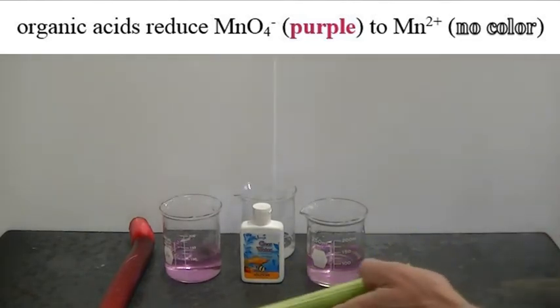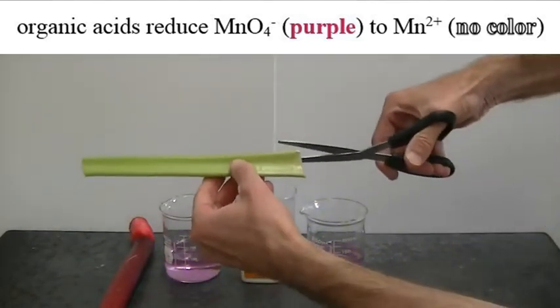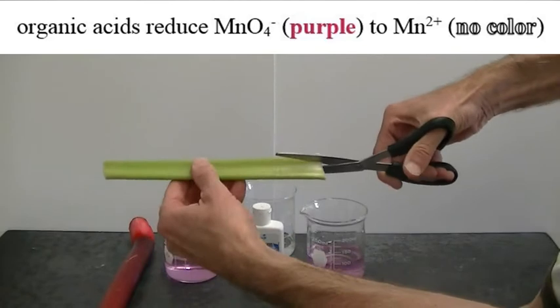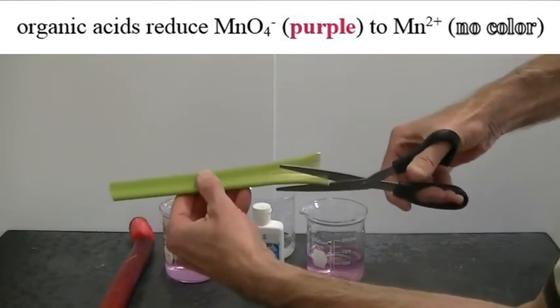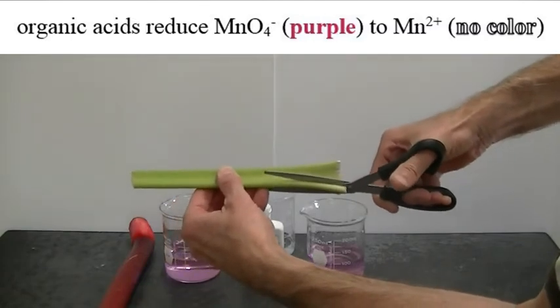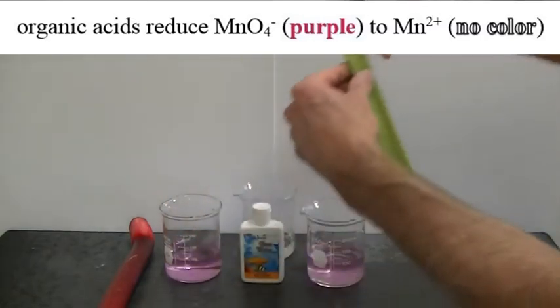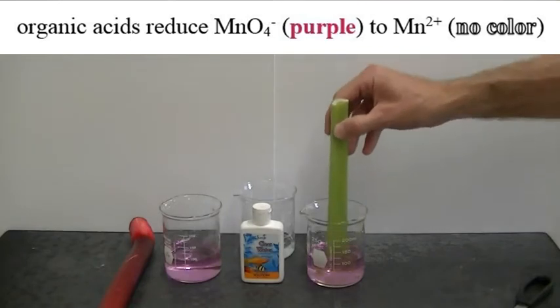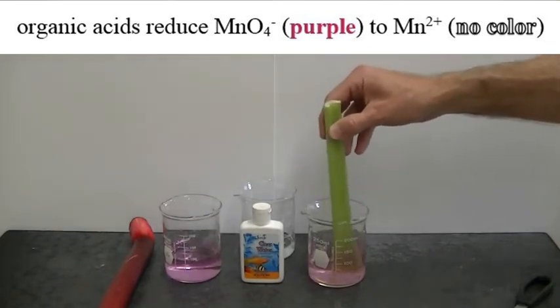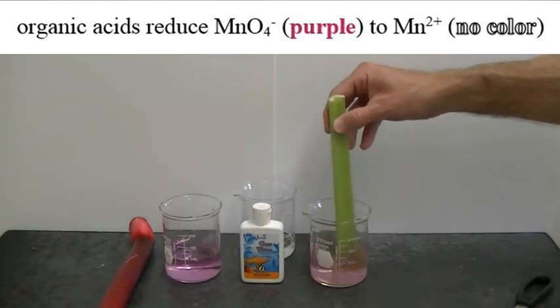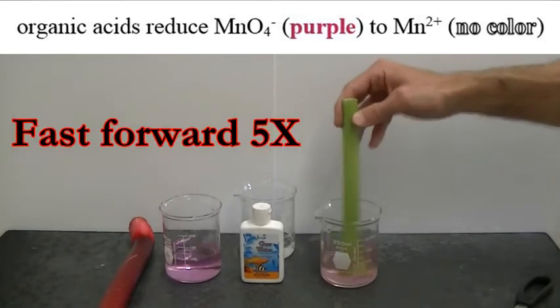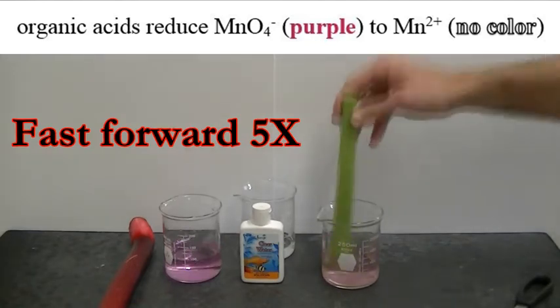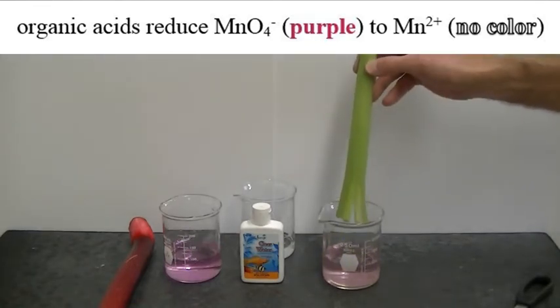Now first, I'll take this stalk of celery and I'm going to cut it three times lengthwise. And the reason why I'm doing that is because I want the contents of the celery stalk to be able to mix very well with the potassium permanganate solution. And I'll just stir the celery stalk into the solution of potassium permanganate. I see a slight color change.